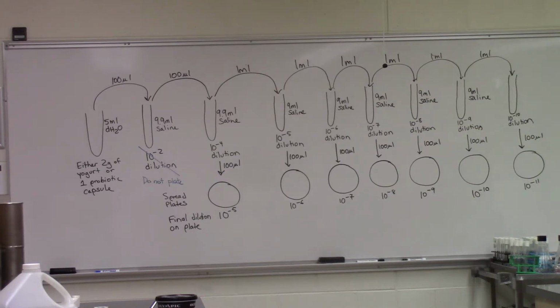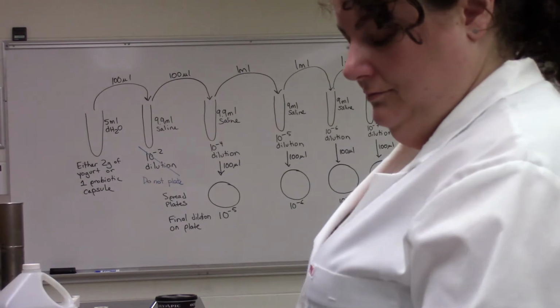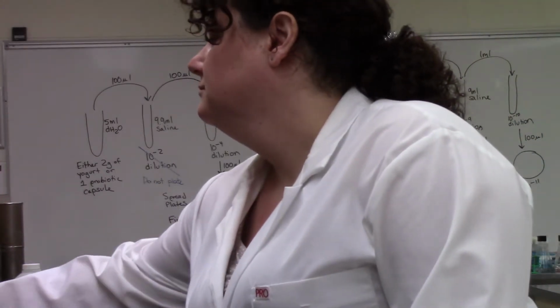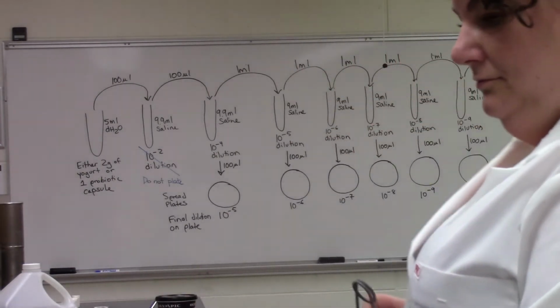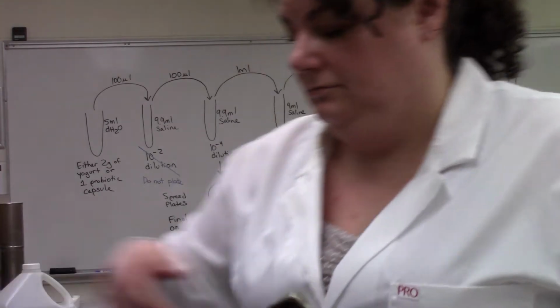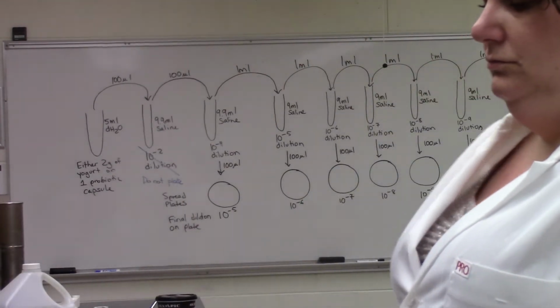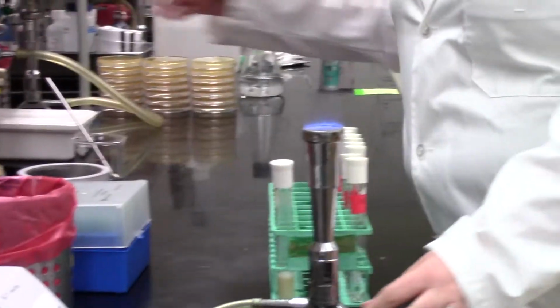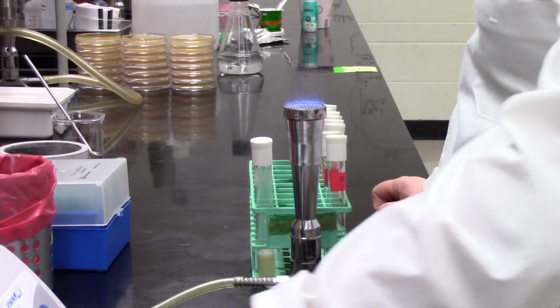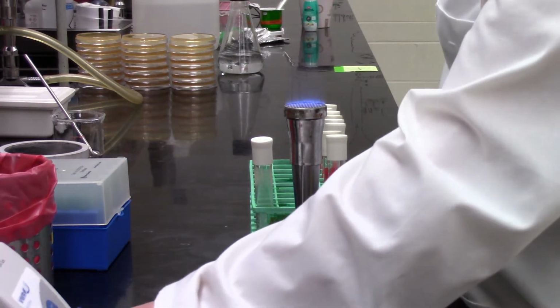Although we're using the probiotic sample right now, when you come into the lab for your labs where you do spread plates and pour plates, you will be looking at E. coli most likely. But the steps of this are exactly the same. You heard the click probably there of the Bunsen burner going on. So obviously aseptic technique is very important again, as always.